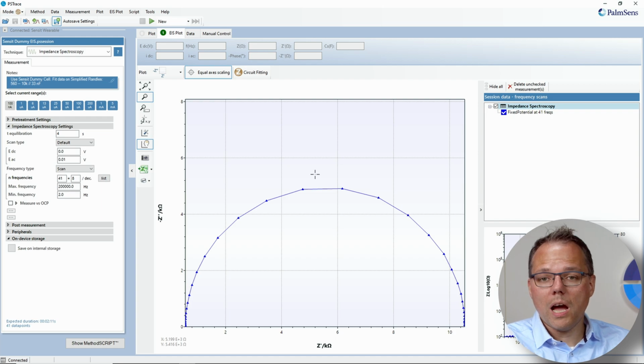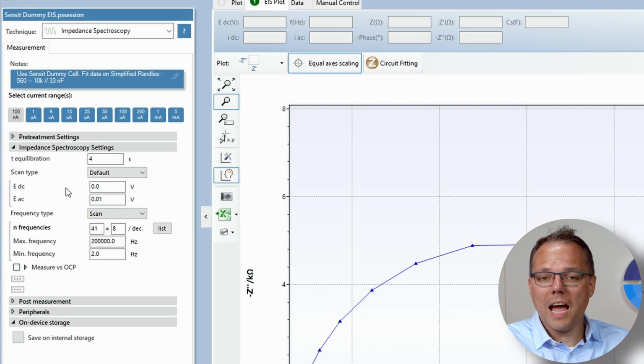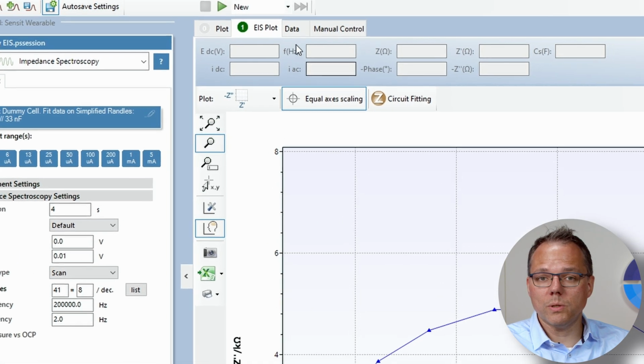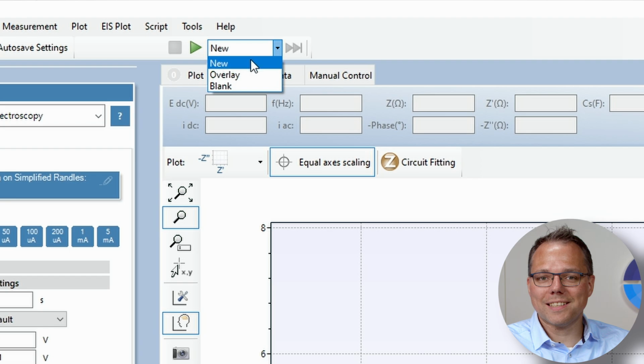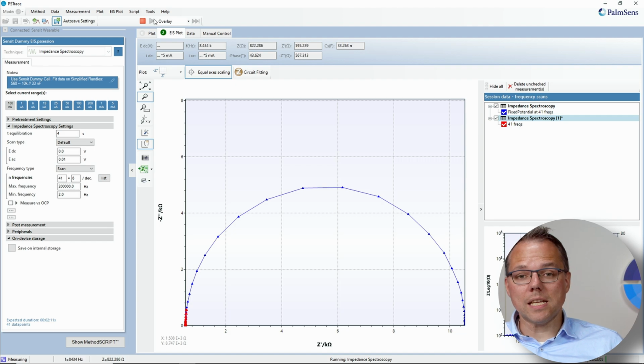Okay, so now I have loaded the curve, so I see how that curve is supposed to look like. And the parameters of the measurement have been loaded at the same time. So if I want to compare my new measurement to this old measurement, I just have to select here Overlay, and then I press Run, and the impedance spectroscopy is starting.